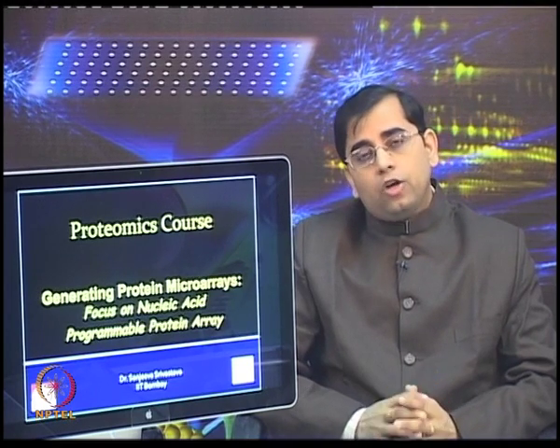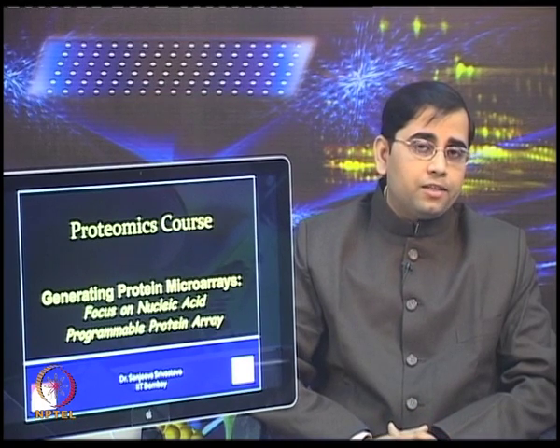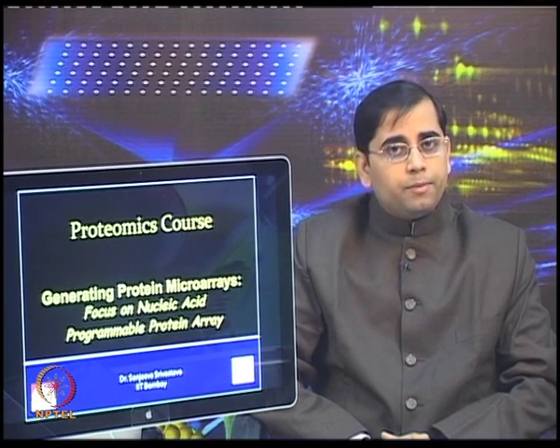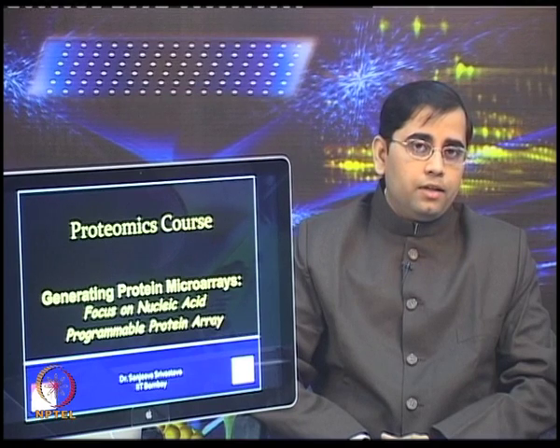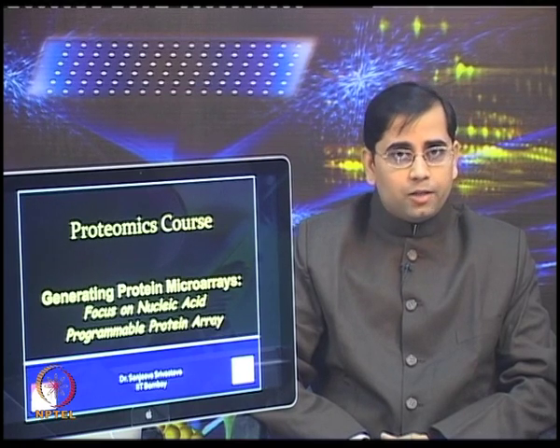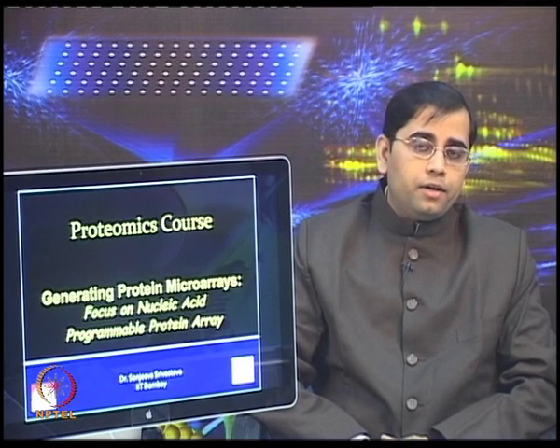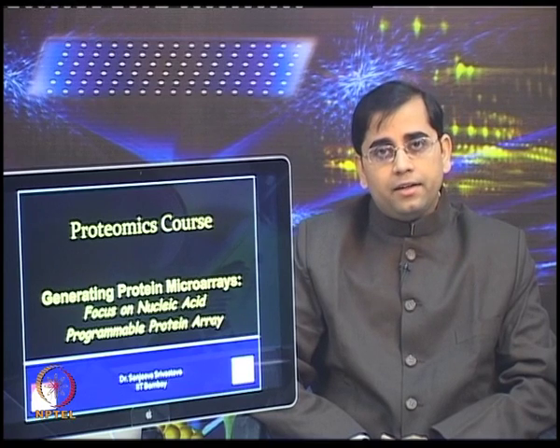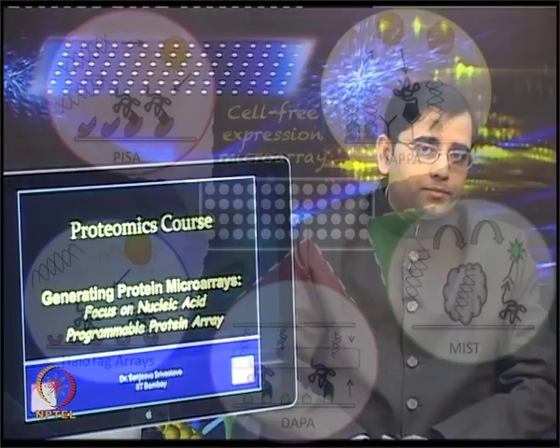So, to overcome these obstacles posed by the traditional cell based protein purification methods, various cell free expression based systems have been generated. In the last lecture, we discussed cell free expression methods and how different types of protein microarray platforms have been generated by employing cell free expression based systems.